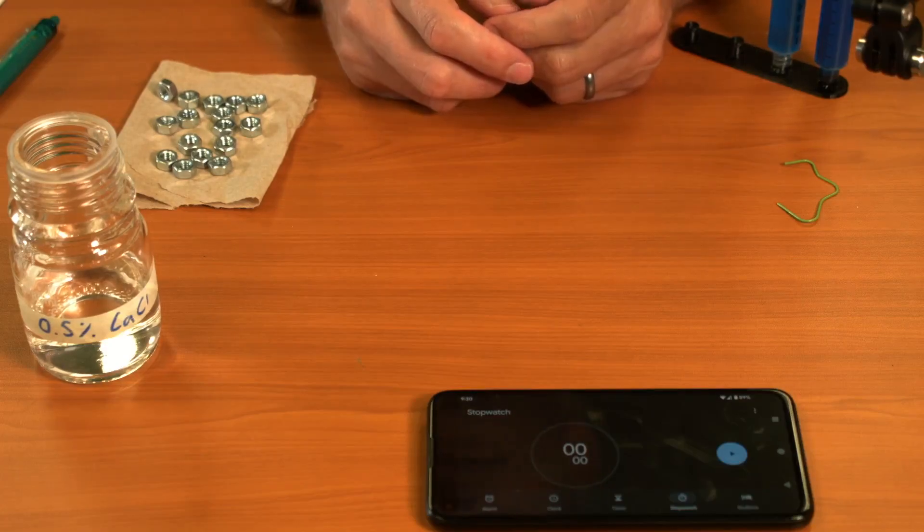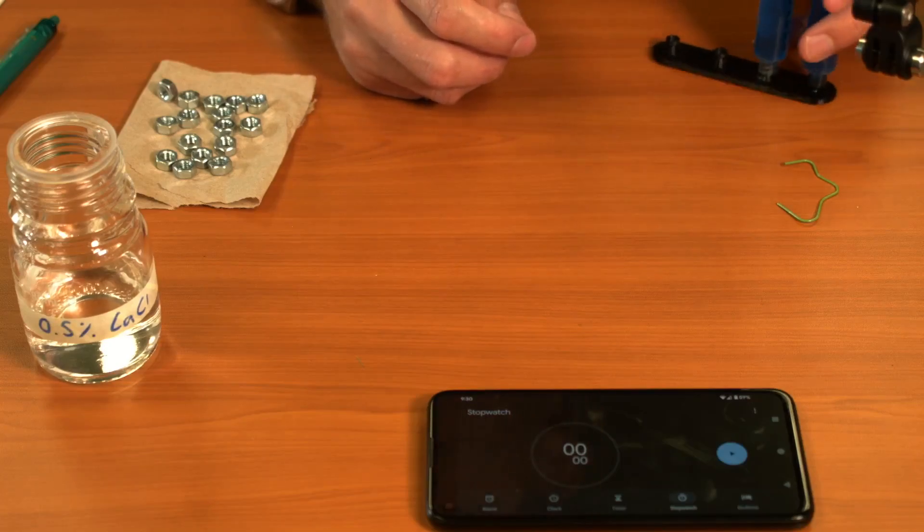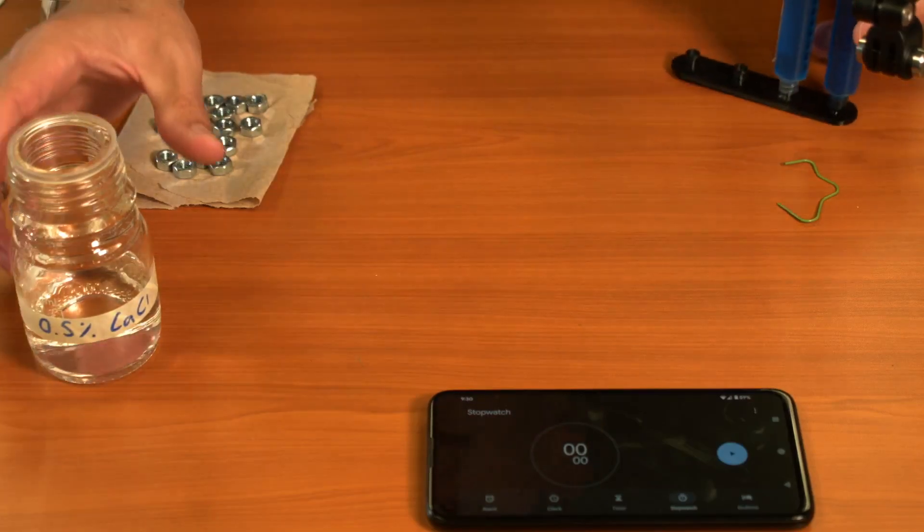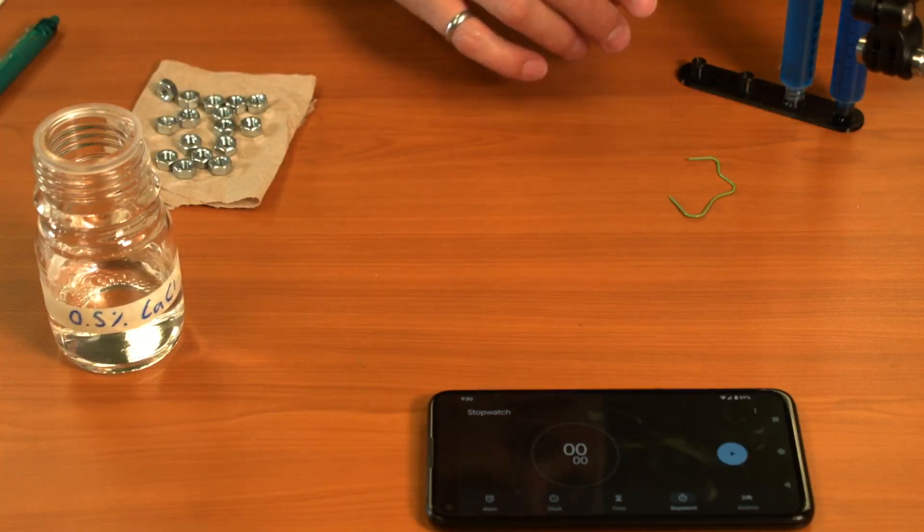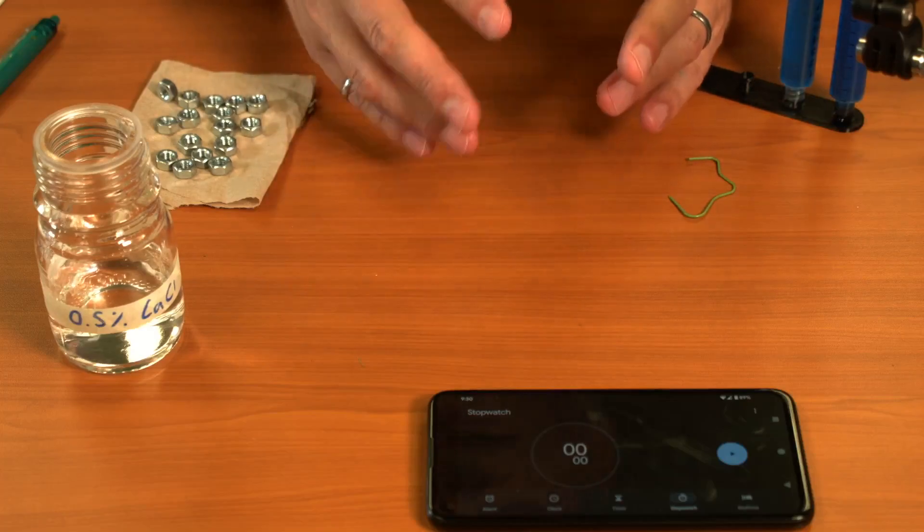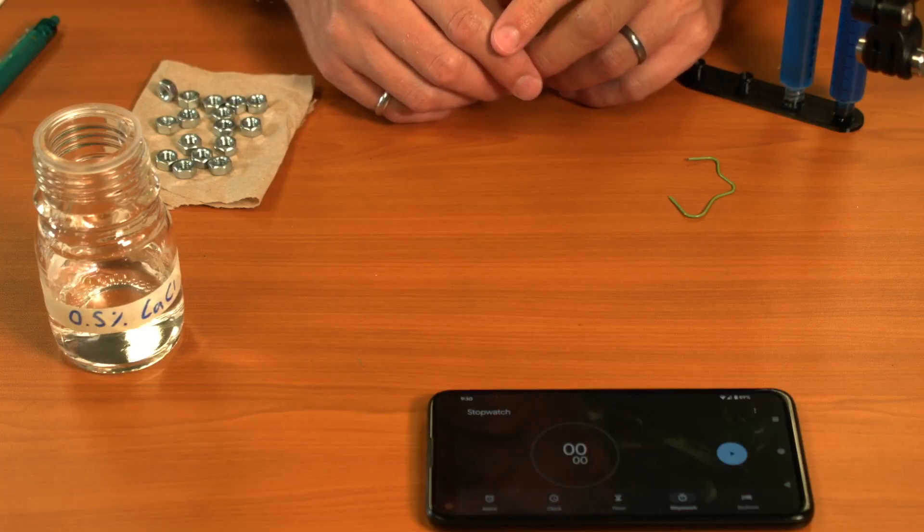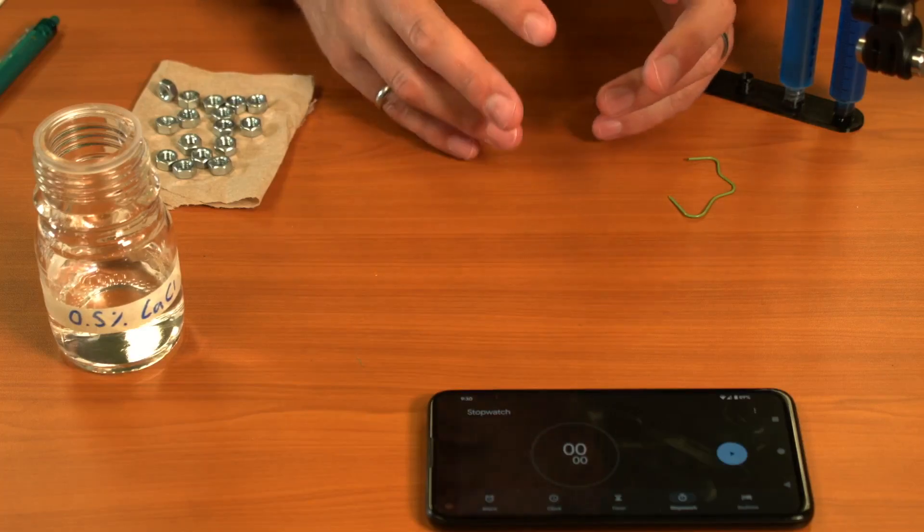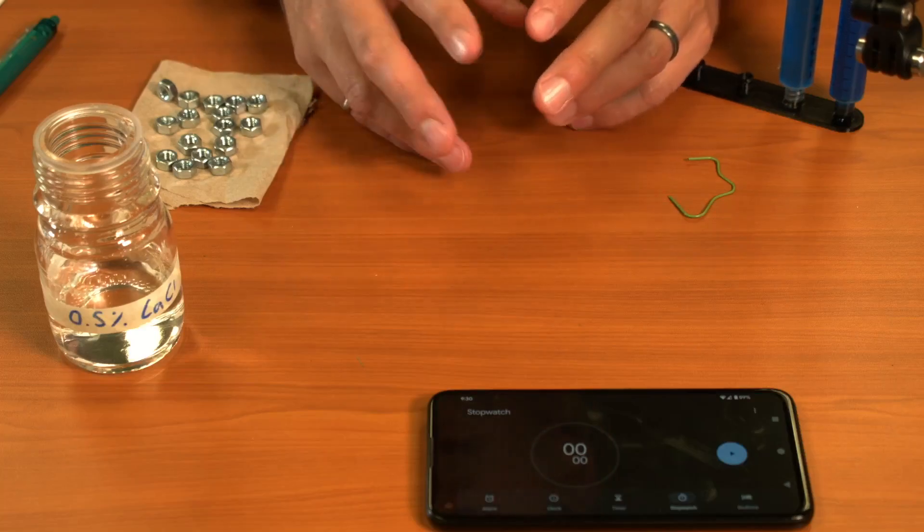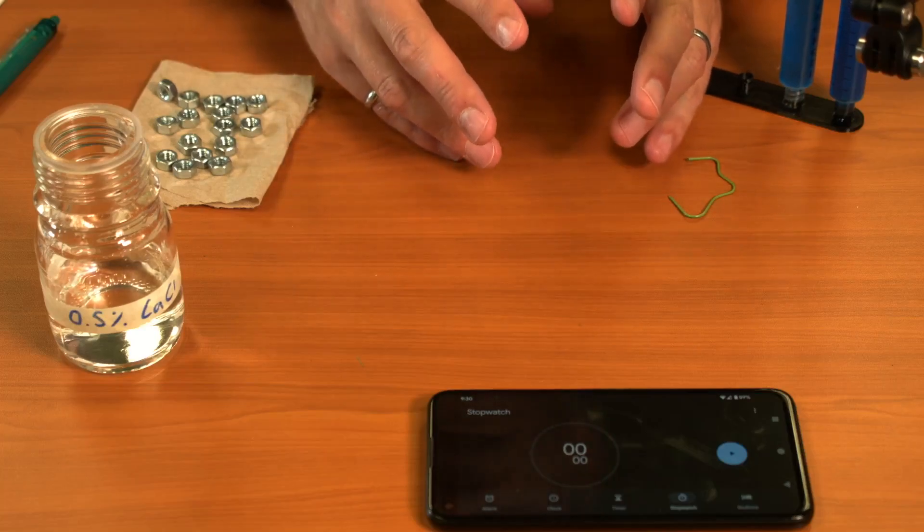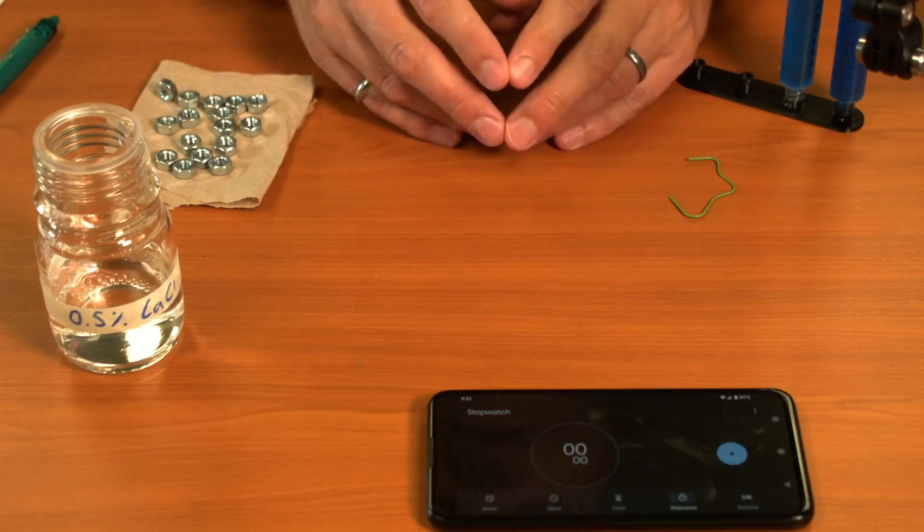Today we're going to be making some sodium alginate rings by cross-linking our gel with calcium chloride. To do this, we need to develop our geometry, in this case manually, and then expose the sodium alginate to the calcium chloride. The calcium chloride will stiffen and transition that gel into a solid, not a very strong solid, but a solid.